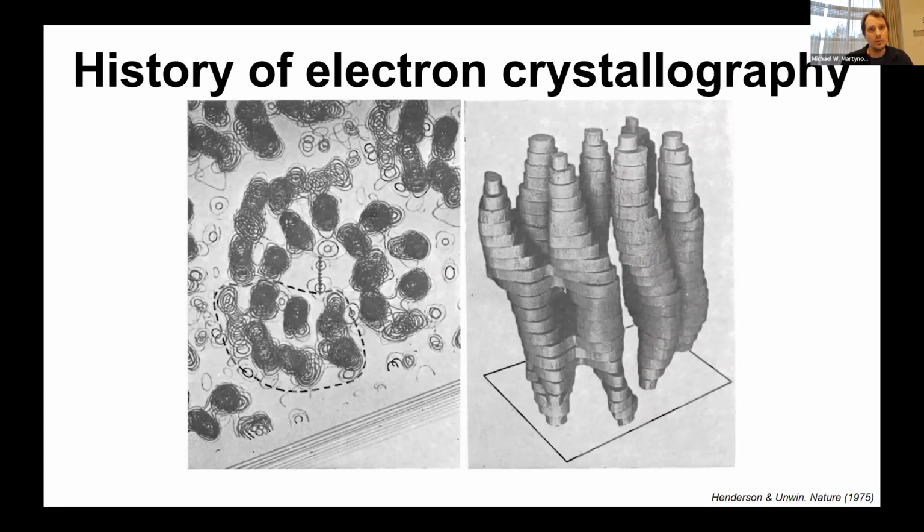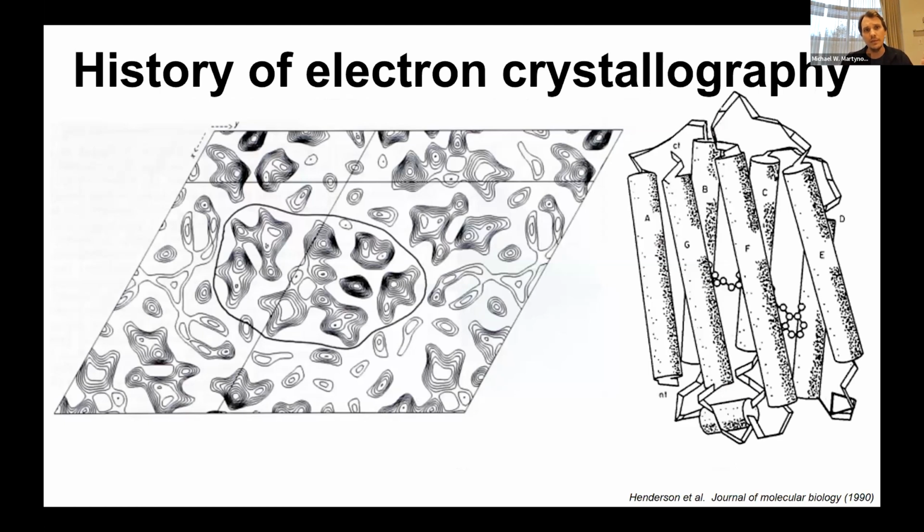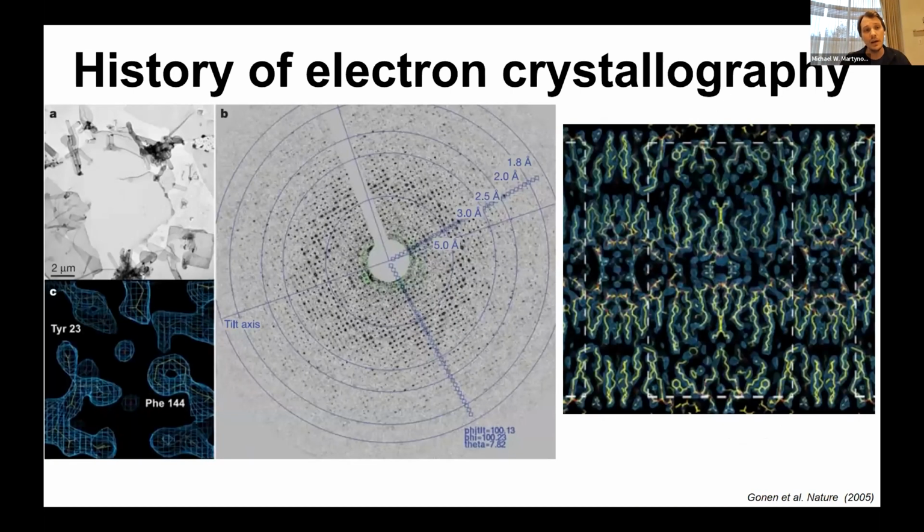They worked on this for about 15 years before they found out that they could push the resolution and see more than just those tubey blobs by, for every crystal they found, taking either an image or a diffraction pattern at multiple angles. So you have hundreds of crystals where each crystal is one diffraction pattern or one picture. You would take the phases from the picture, and the diffraction pattern would give you the amplitudes. You can combine them together to get higher resolution, and you can make a nicer model to about 3.5 angstroms.